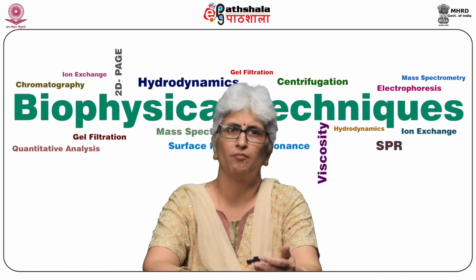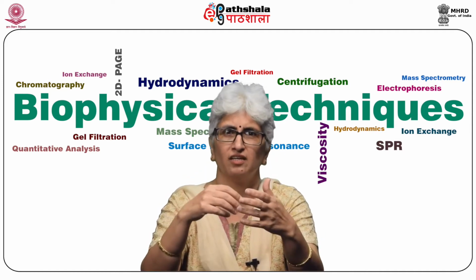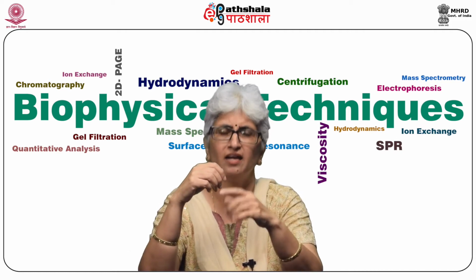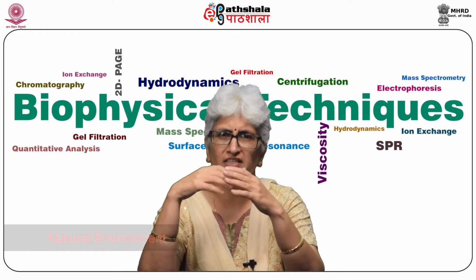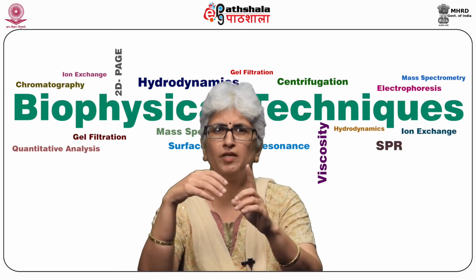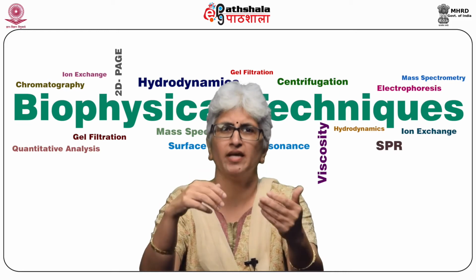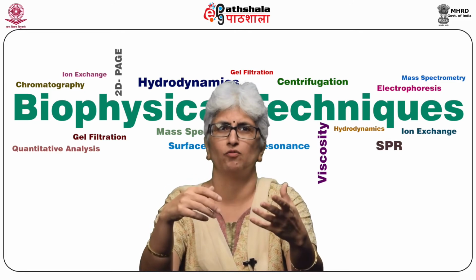So what are the precautions one should take while doing affinity chromatography? First, selection of appropriate media and affinity ligand is very essential. The buffer should be selected in such a way that it does not interfere with the affinity between ligand and biomolecule. It should be capable of maintaining the natural environment needed for their interaction. The sample should be prepared in appropriate buffer, and it should not be very concentrated, as it may hinder the affinity due to overcrowding of other molecules.